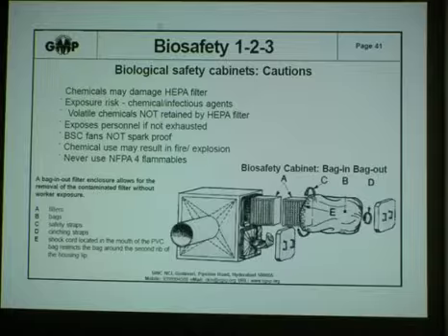Now, biosafety cabinet exhaust filters, supply filters are all contaminated filters. Before you replace those filters, there has to be adequate decontamination and adequate safety for the person who is making the change of filters, removing the soiled filter and replacing it with a fresh filter. There is a concept called bag in and bag out of HEPA filters that is illustrated here. And this system should be used where possible for removal of filters and replacement with fresh filters, so that the technician changing the filter is not exposed to undue biological or other risk.